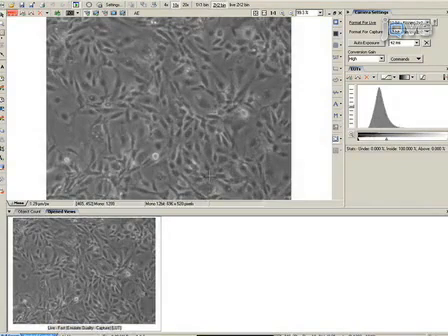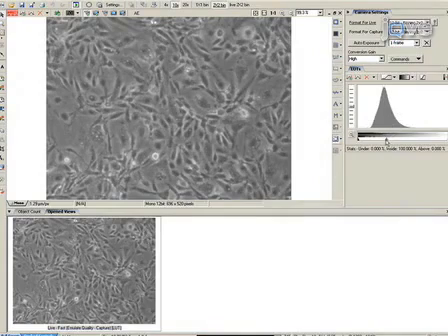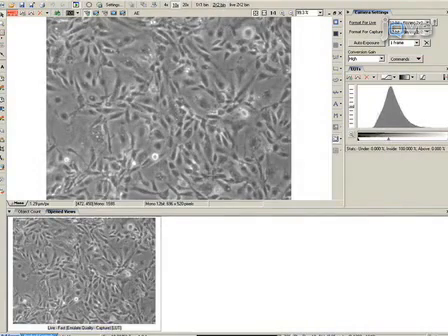Once the image is in focus, reset the exposure to 1 frame per second and adjust the light on the microscope. The image should appear on the computer and should no longer be visible in the microscope. The light histogram can then be adjusted to remove background exposure or to improve cell clarity. Click on 2x2 bin or live bin to obtain an image that is ideal for movie capture.